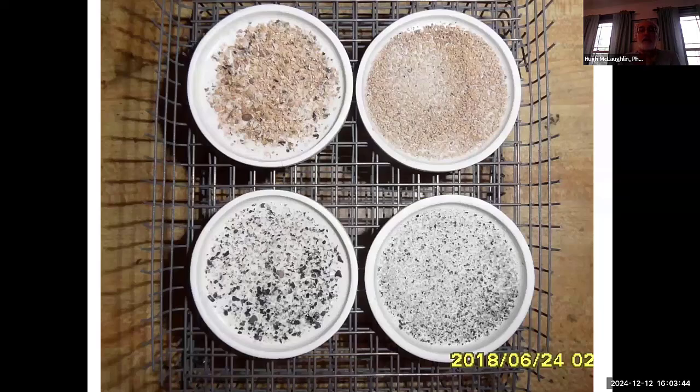This is an example, and I've written this up in earlier talks, of how you can do ash by taking the tops of those little crucibles and putting them in a muffle furnace. Now, you need 500 degrees C, which is an intermediate temperature compared to the typical ashing that's called for, which is, I don't know, 900, 750, some ridiculous number.